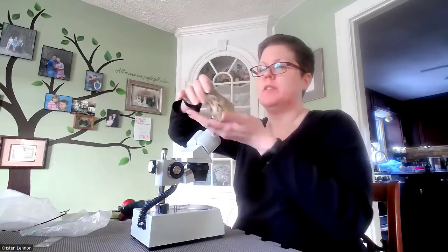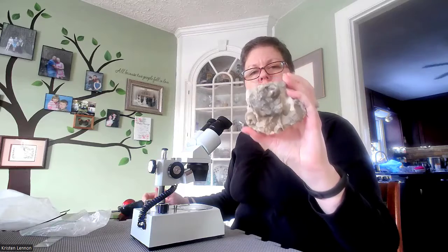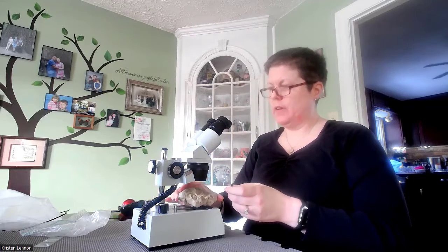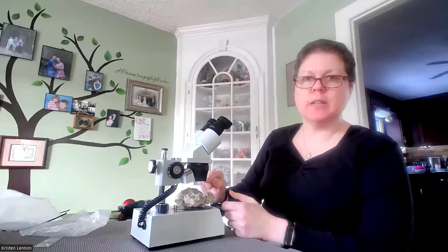You might be wondering, what is this part back here for? Why would I ever need to move the head up or down on a dissecting microscope? Well, here's an example. What if you had this great big thick fossil? This is actually a rock that's full of both imprint fossils and mineralized fossils, and I want to look at it under the microscope. Well, it's not going to work very well to be just barely underneath the objective lenses.